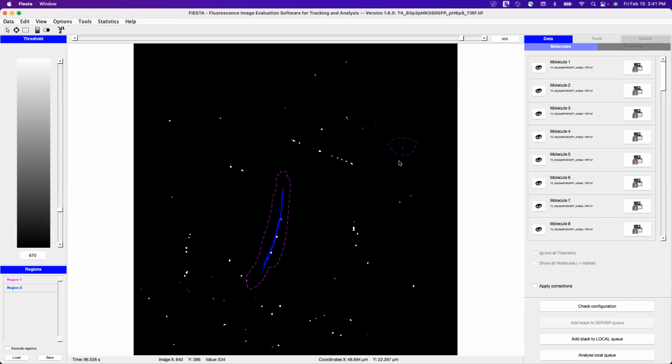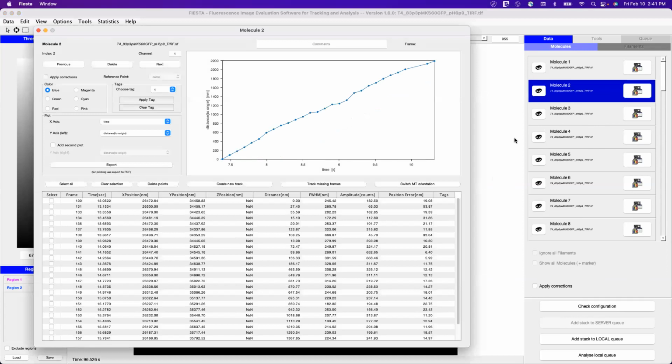So if you only have like 1 or 2, and one of those has error in its positional change, when it goes to subtract that out, you're then adding error to all of your traces. So you really want to make sure, when it selects which ones, you go through and make sure that they all have similar traces, so that it will be more accurate drift correction.